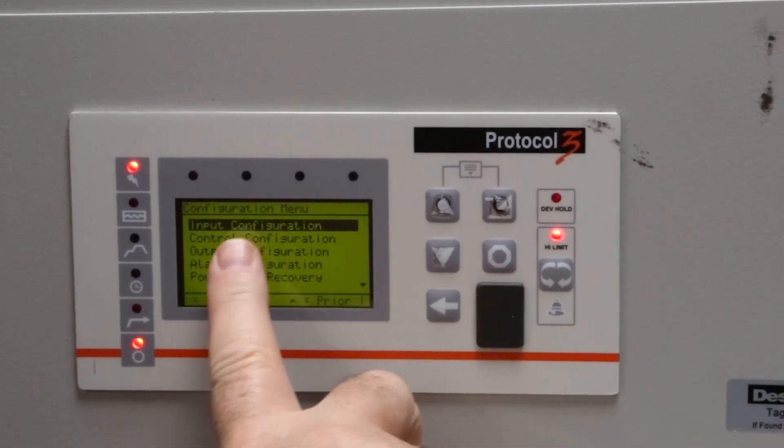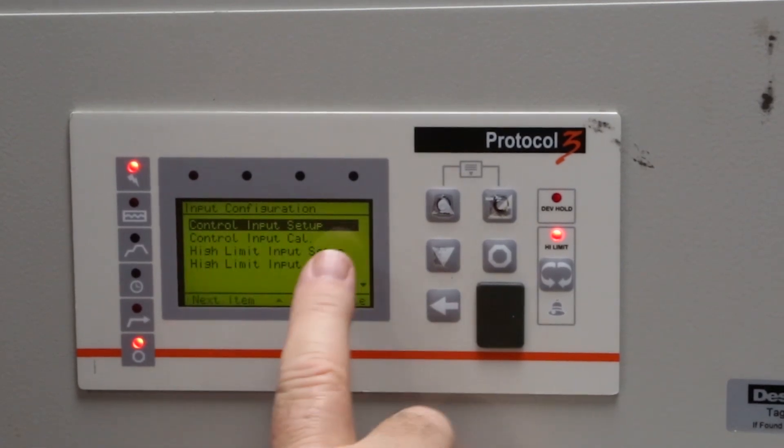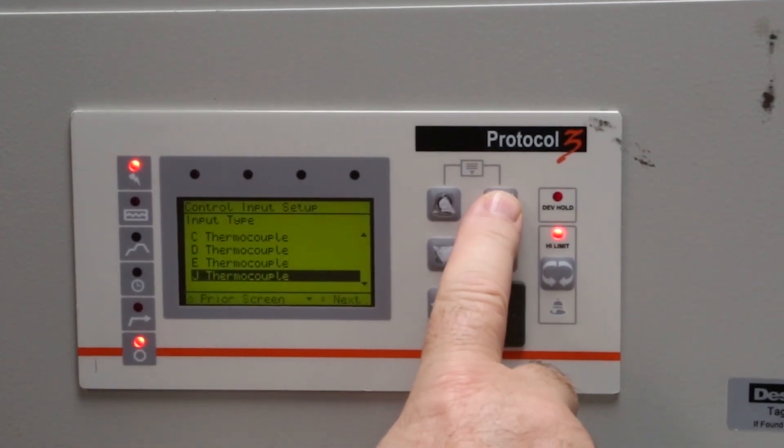Confirm input configuration is highlighted, then press enter. Confirm control input setup is highlighted, and press enter. Confirm that J thermocouple is highlighted, and press enter.